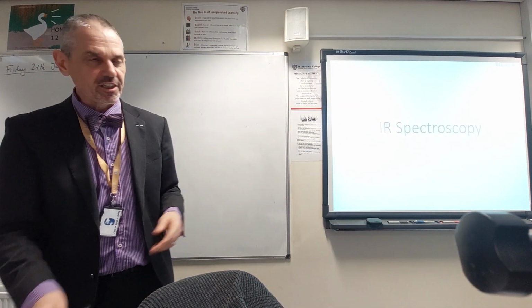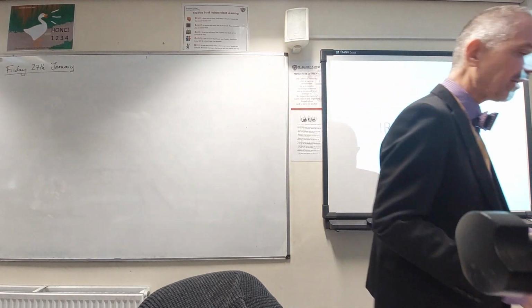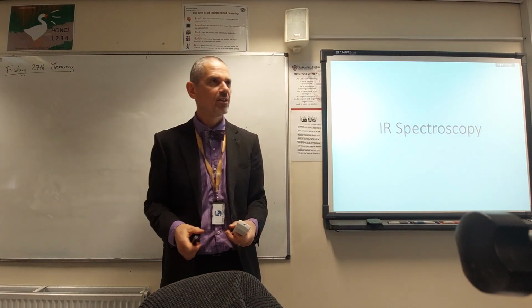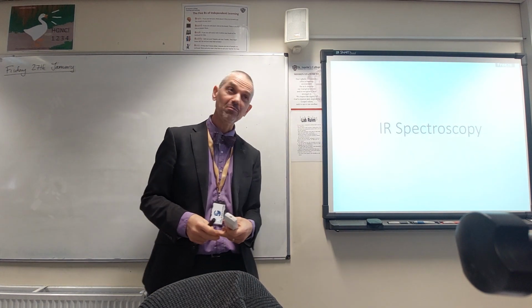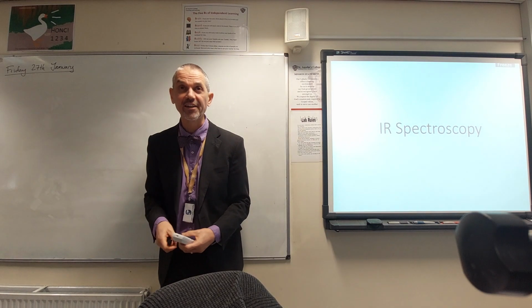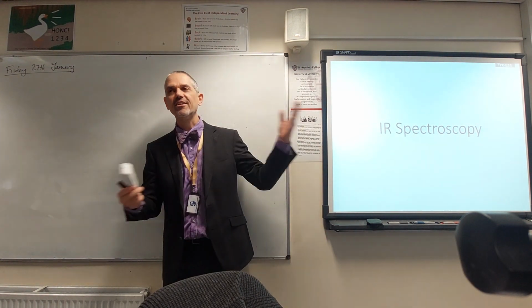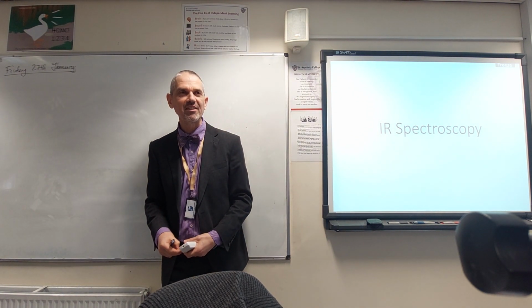Again, covering stuff that you should have done last year. Does anyone remember anything about infrared from last year? What it is, what it does, what it tells you. Mostly what it tells you, really. That's what we want to know. If I stick a substance into an infrared spectrometer, I get out a pretty graph. What does that tell me about the substance? What do I learn?